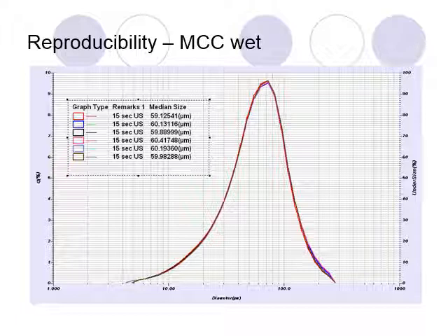This tells you that the machine is very reproducible and very good at making a measurement. This also tells you that that specific product, as it was dispersed the way it was done, seems stable with ultrasonic. Some things with an extra ultrasonic will break apart more. Other things actually can agglomerate from ultrasonic. So this is sort of where I would take multiple measurements and judge the behavior of something to determine if I'm doing a good job as a particle size measurement person.